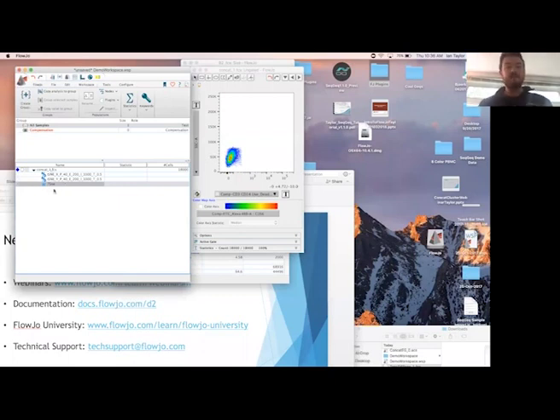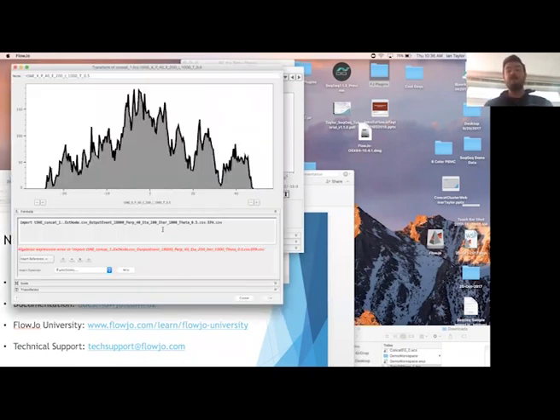concatenated file. So once the t-SNE has finished calculating, you'll notice we get two new artifacts. These are our two new parameters. They're derived parameters, and if you double click on them, they'll look a little different than your normal derived parameters. That's because these derived parameters are actually written to a CSV file elsewhere on your machine, and FlowJo is just calling out to that CSV file in order to pull in these new parameters, but it's not an ordinary algebraic kind of parameter. And so you get this little error. It's nothing to be concerned with.